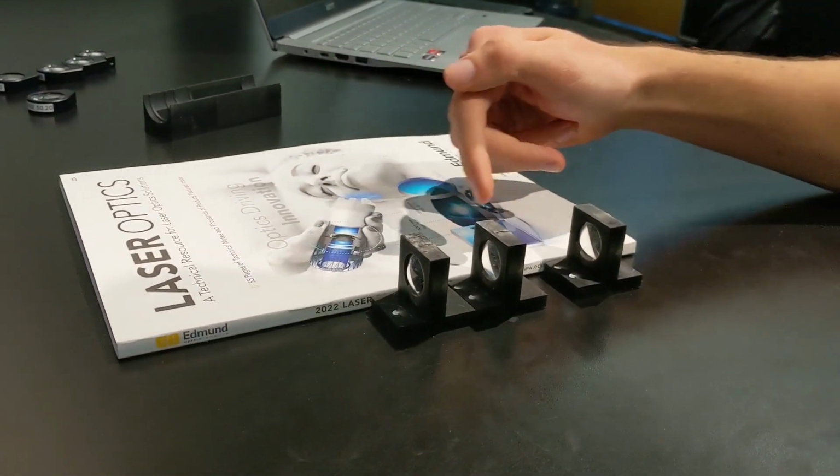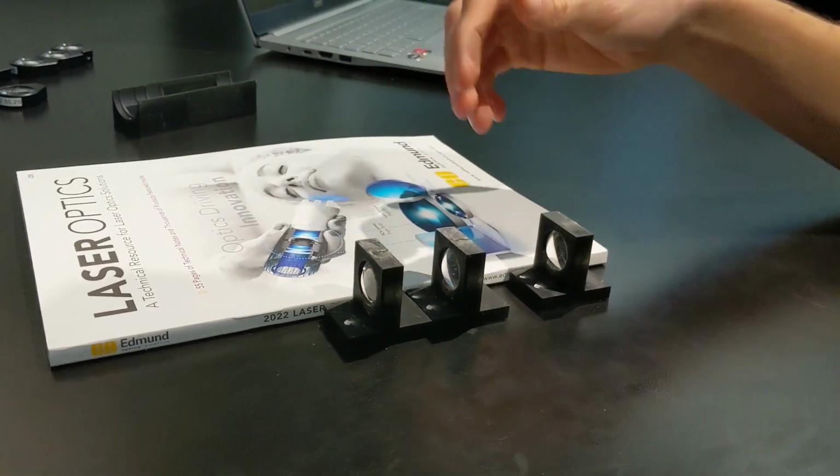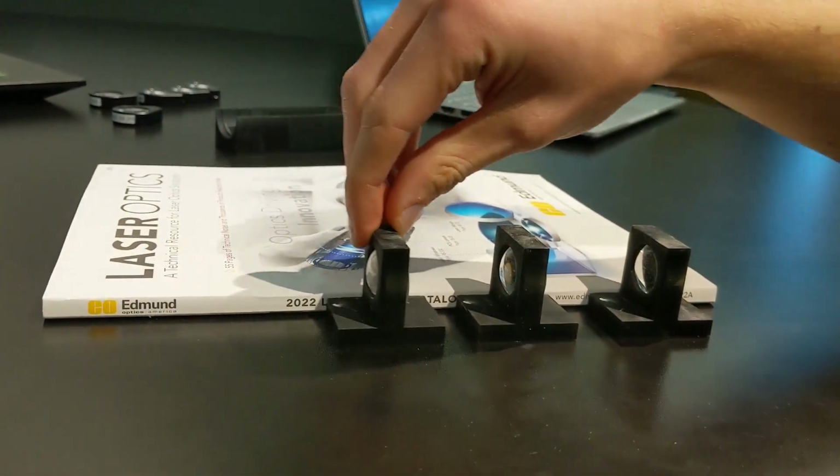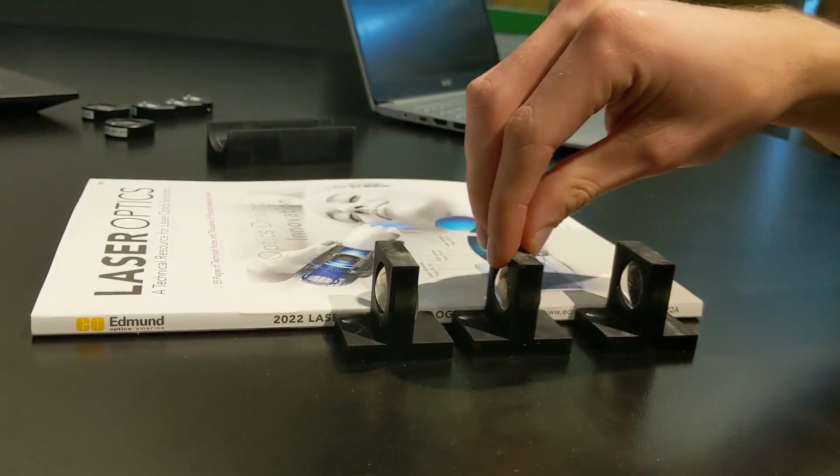We started with the same distances between the lenses as before, but now with this setup, we can separate the lenses and we can see the effects that it has whenever we change the distances between the different lenses.